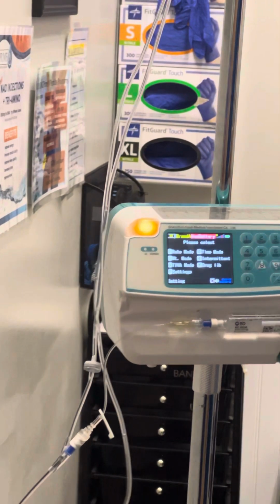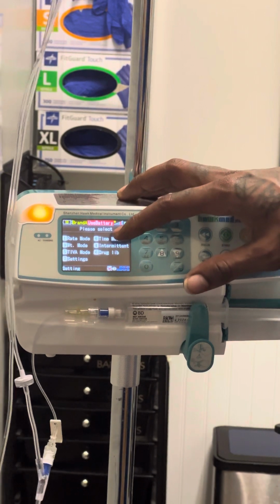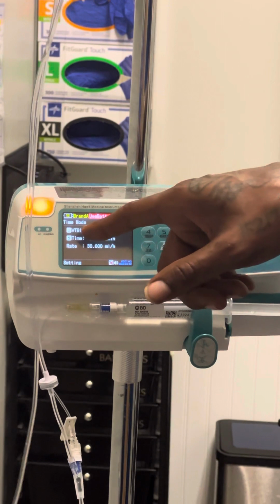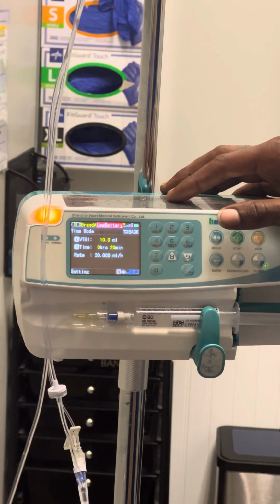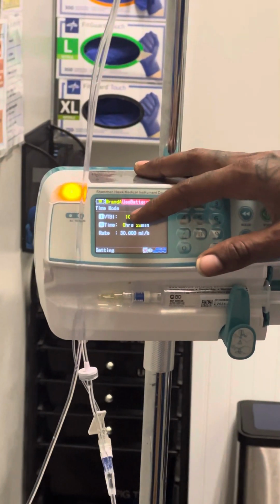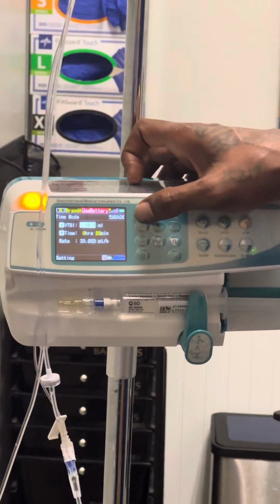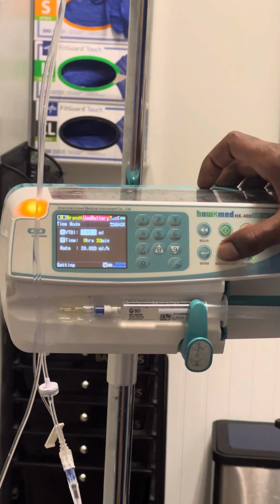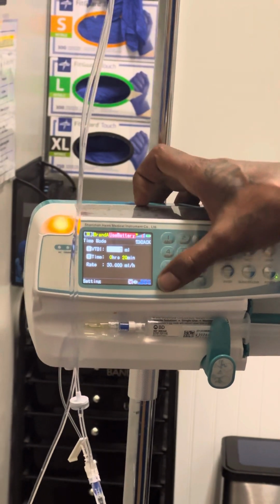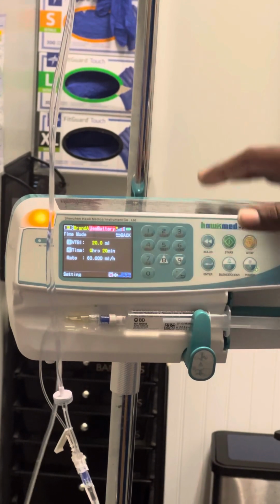All right, now for the operation of the pump, we're always going to work in time mode. And as you can see, time is under the 2 designation, so I will hit 2. First question is going to be in regards to the volume of the syringe we're using. So we're using a 10 ml or 10 cc. It's already been set in there, but let's say I wanted to change that to a 20. I would just hit 1 where you see the value. You would hit clear on the pump, and then you would enter a 20 if that's what you were using. Once you've entered the value, you hit enter, and that's set.